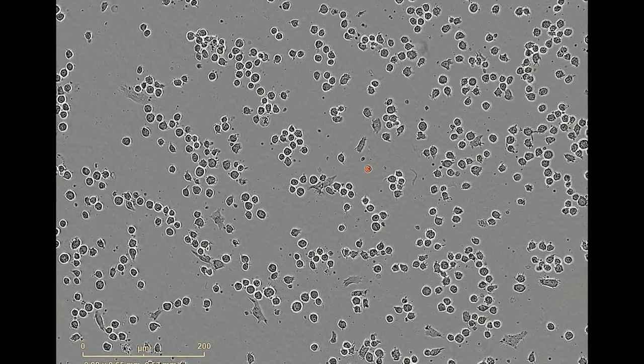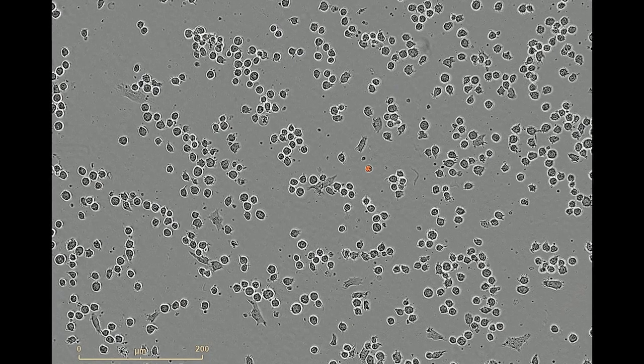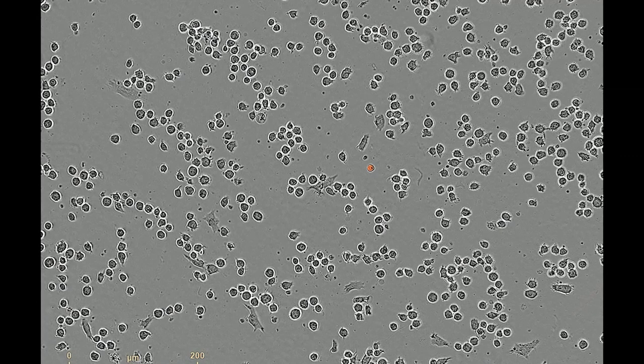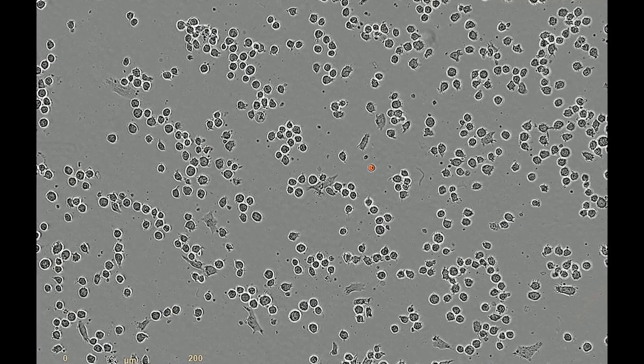To observe phagocytosis in these cells the Parkinson protein alpha-synuclein was labeled with pH-rhodo and added to these cells. The labeled protein is non-fluorescent under normal conditions.